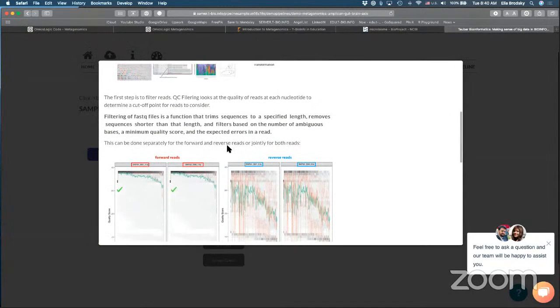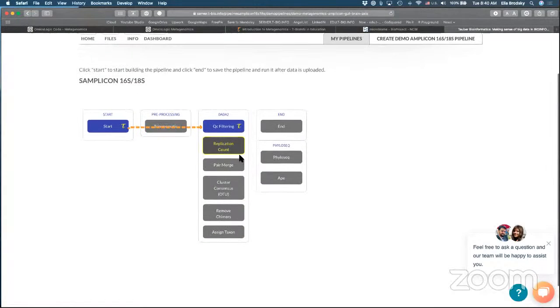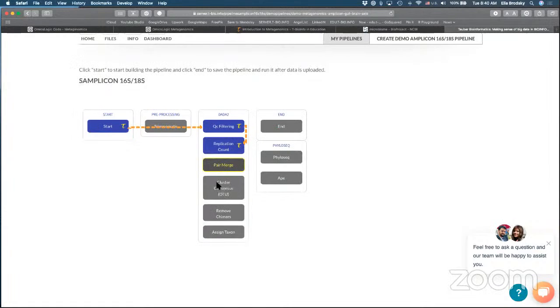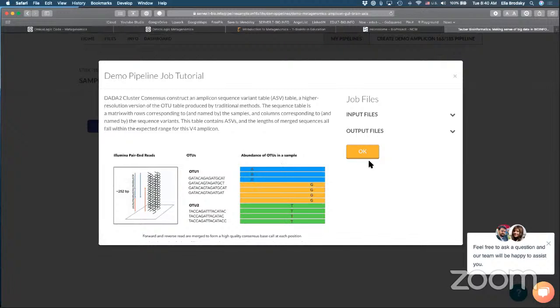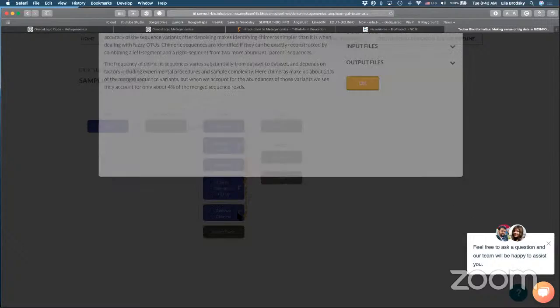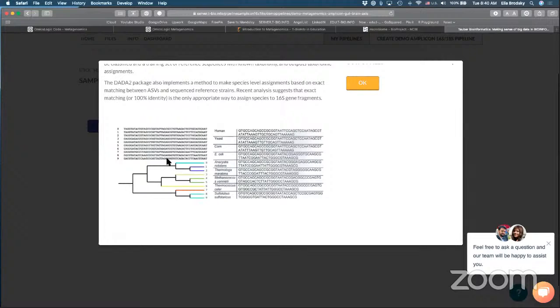The bioinformatics workflow here is focused on accurate sequences because they play a major role in our ability to accurately assign taxonomy to the different operational taxonomic units. The way it is done is by denoising and then merging these paired-end reads to cluster into operational taxonomic units and remove chimeric operational taxonomic units, to assign taxons only to the accurate sequences.